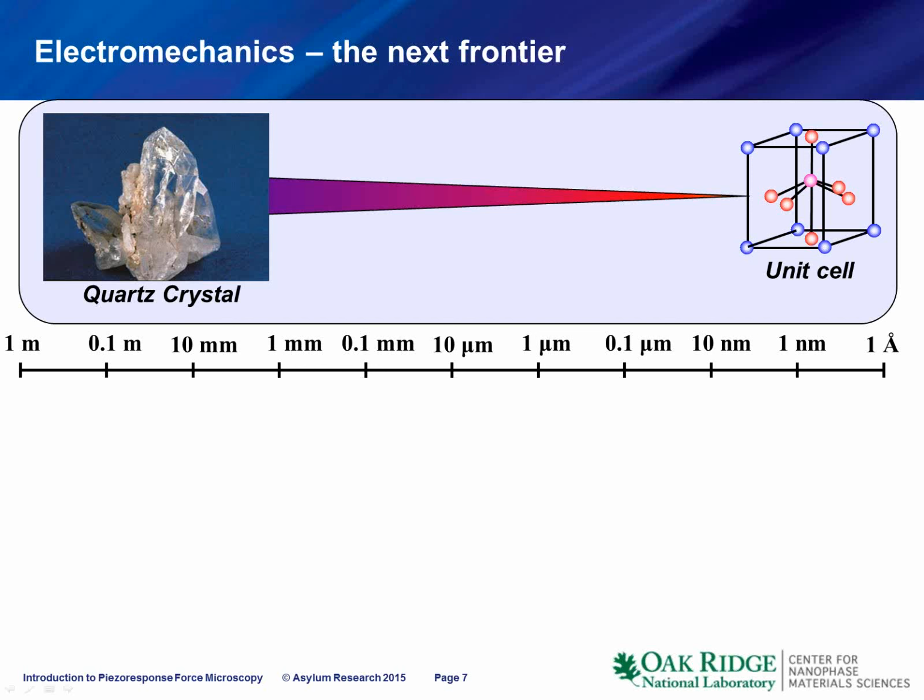I can take the same crystal, go to the X-ray, or if you are in Oak Ridge, to the neutron scattering machine, and I can study in detail the structure of this material. I can study the phonons, sort of everything that defines the physics of this system. And then I can say that the properties measured of the macroscopic object can be directly linked to the structure measured on the level of the single unit cell, because all unit cells are the same.